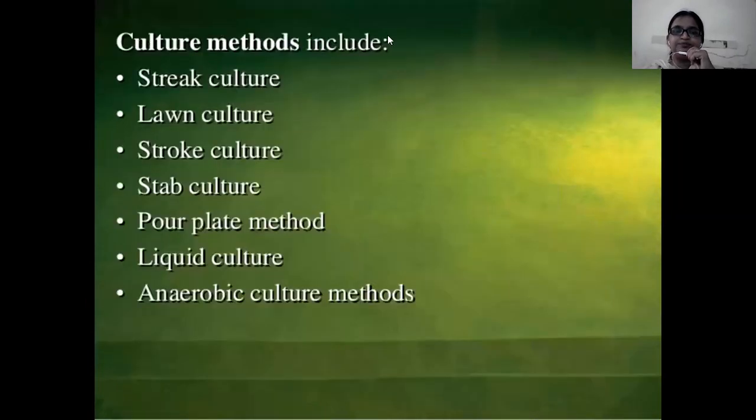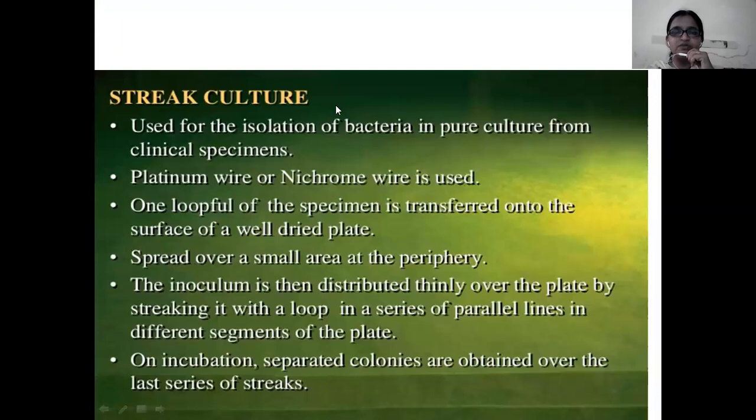Now, till now we have learned the different types of culture media. Now we have to study different culture methods. They are streak culture, lawn culture, stroke culture, stab culture, pour plate, liquid culture, and anaerobic culture methods. Now, streak culture is used for pure culture isolation.